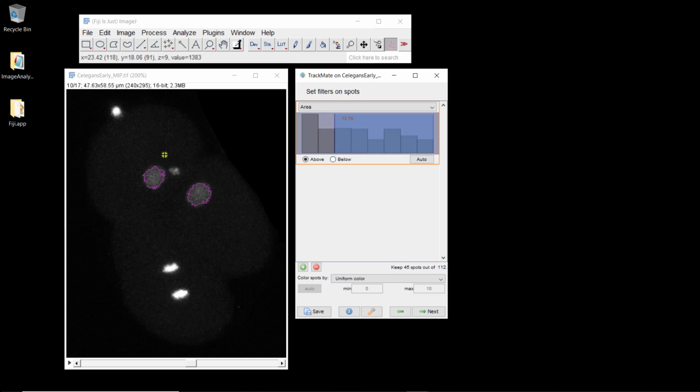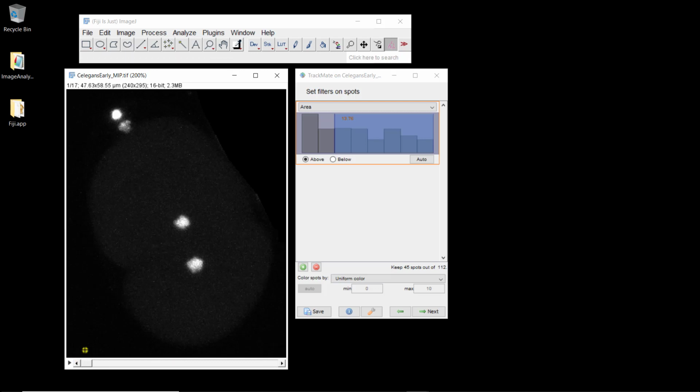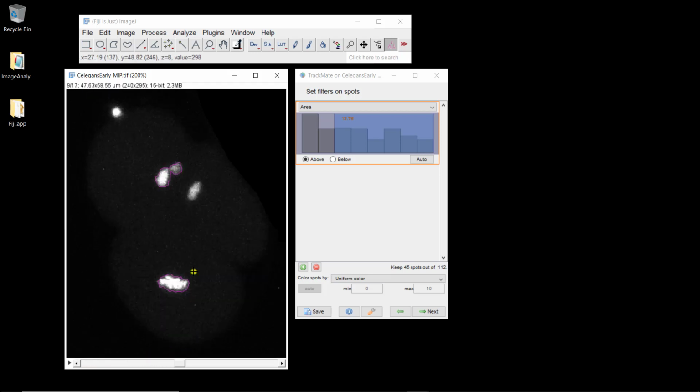And so you see this has been filtered out. So here, you might think, okay, I don't have this thing, so that's good, but I don't have these ones as well. Then I have them all the time. I don't have this one. I don't have these two. So maybe it's better to keep having this one.